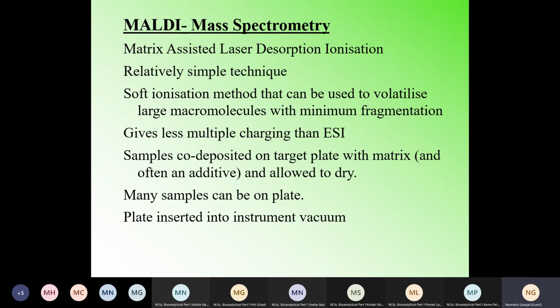This is very similar to FAB. There are only small modifications. The sample is co-deposited on the target plate with the matrix and allowed to dry. Many samples can be on the plate.